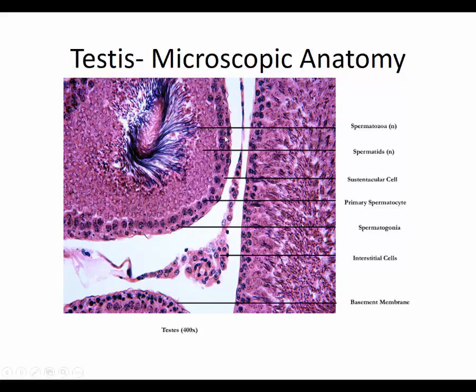On the very outer edge, I said, are the very beginning cells that are diploid. We'll pick this one here that has the label: spermatogonium, and more than one is spermatogonia. The way I remember this, it sounds kind of silly, but it's going to be a sperm, using farm language, Midwestern slang. It's destined to be that, but it's not there yet. This is a diploid cell. It has 46 chromosomes, or 2N. It's on the outside, destined to become a sperm cell.